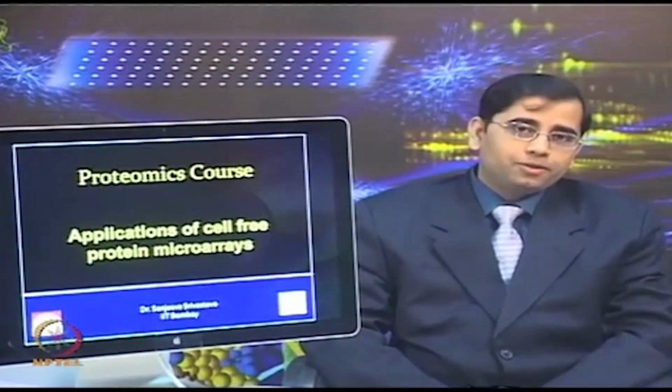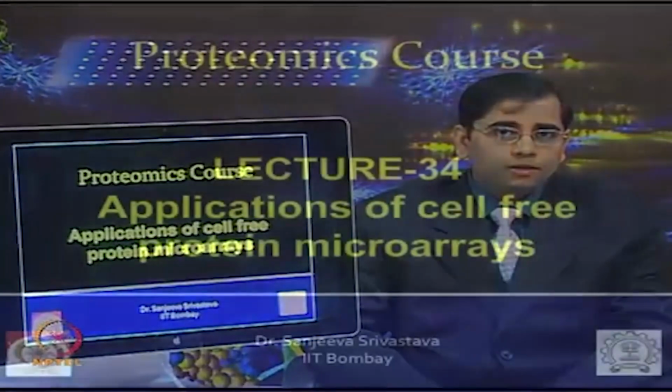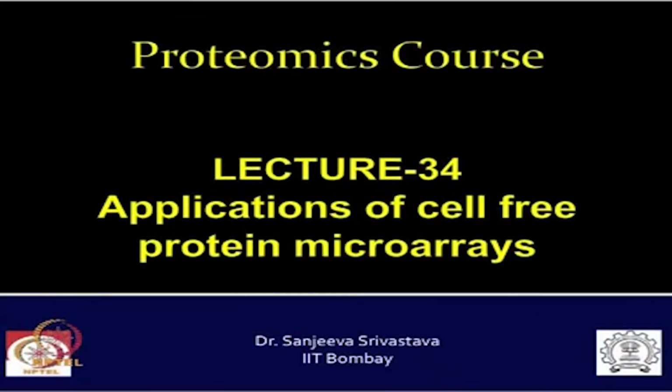Welcome to the Proteomics course. In today's lecture, we will talk about applications of cell-free protein microarrays.